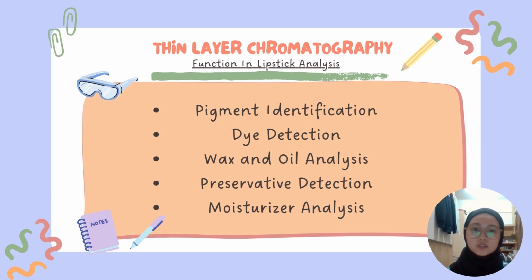Number 4, preservative detection, where thin layer chromatography detects the presence of preservatives such as parabens, which can affect the safety and shelf life of lipsticks. And the last one is moisturizer analysis, where thin layer chromatography can analyze the types and amounts of moisturizers such as vitamin E and aloe vera that are used in lipsticks to provide hydration and nourishment to the lips.